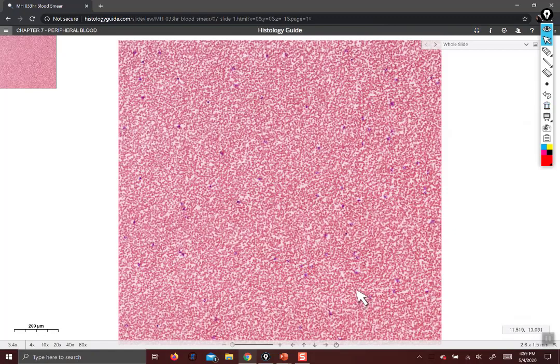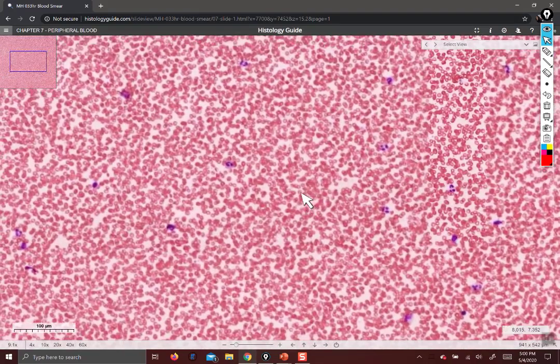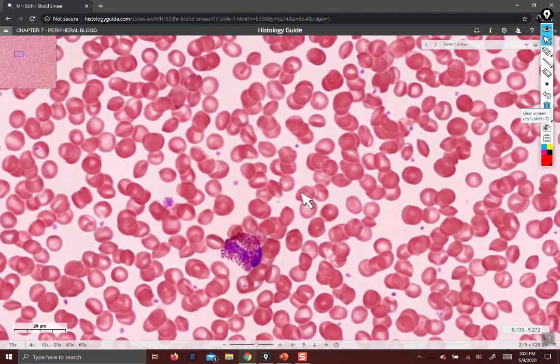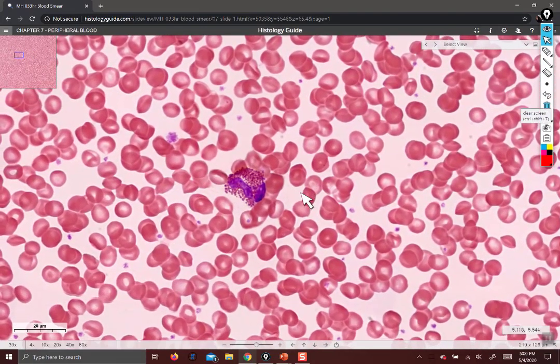For example, I'm detecting extra redness about this one, which makes me think it's an eosinophil. Same with that one. I'm actually going to start with this eosinophil — let's go find out if I'm right. Yes, I am. One of the nice things about virtual histology is you can zoom really far in with pretty good clarity, which isn't always possible with in-person microscopy. Here is an eosinophil — it's got rosy granules and a bilobed nucleus.